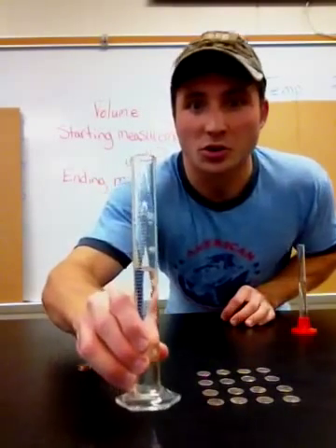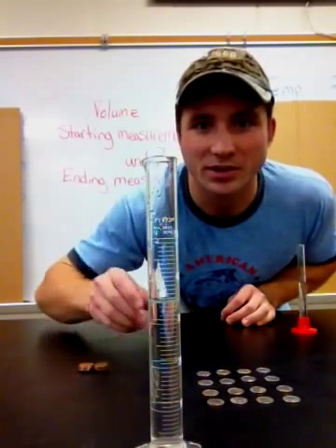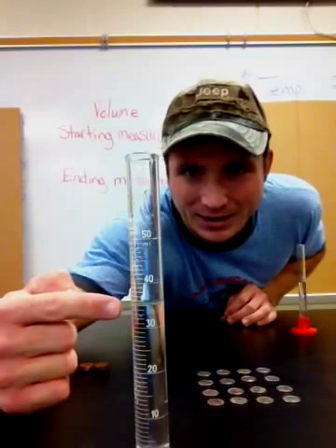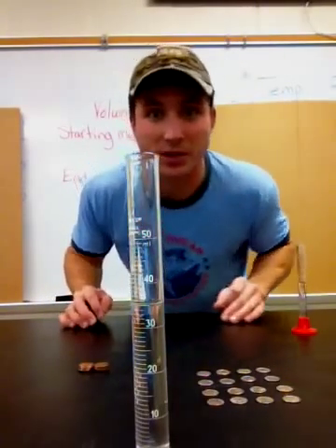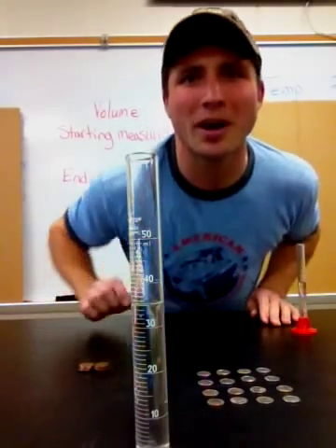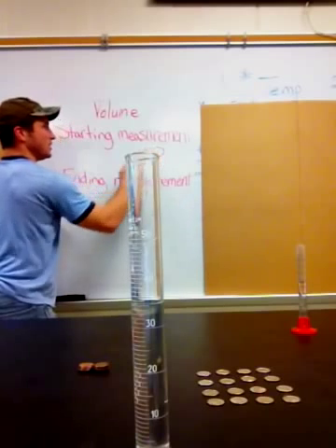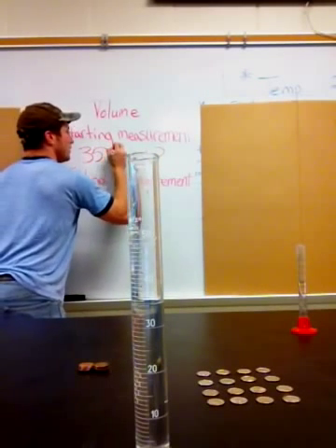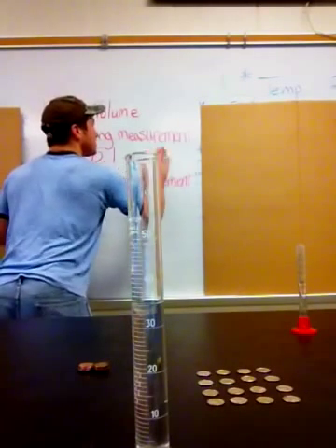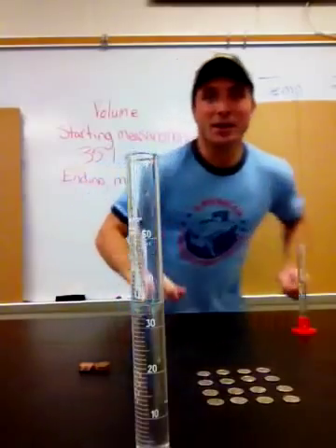The first thing I'm going to do is get an accurate read of the exact amount of water in the graduated cylinder. You can see here it's at exactly 35 — but if I wanted to go to three significant digits, I would say it's slightly higher than 35, so I might say 35.1. Go ahead and record that: starting measurement 35.1 milliliters.